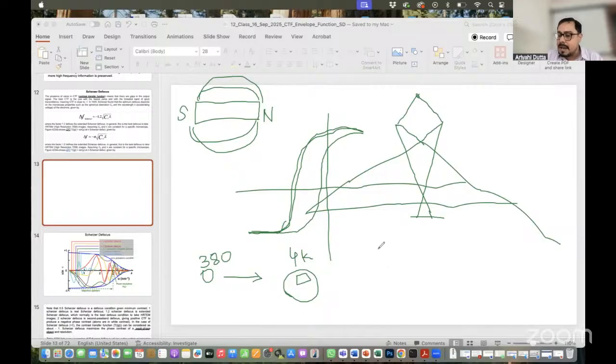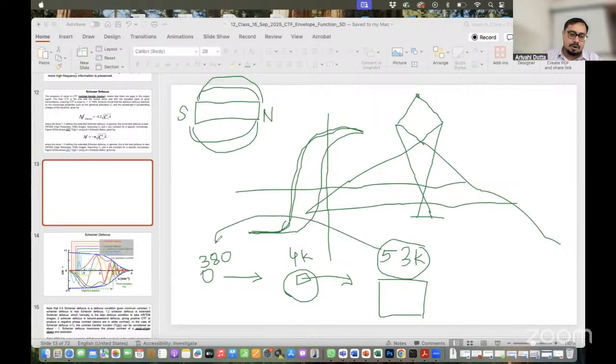And when you are going to 53K, if you just repeatedly do this, you are imaging something at 53K, you cannot see the entire hole. You will just see this small area, that small area you can see at 53K. Now, if you just constantly do this, going to very low mag here, and then jumping around here, collecting again, so back and forth, low and high, and you are doing it very quickly.